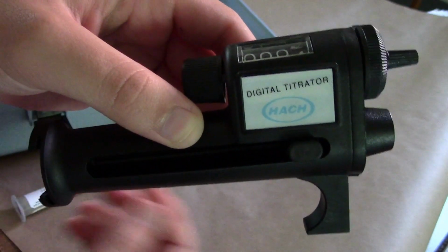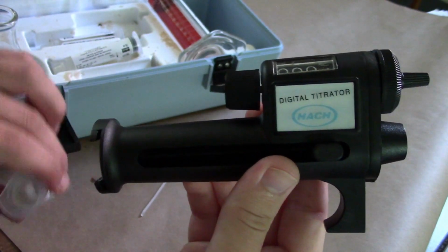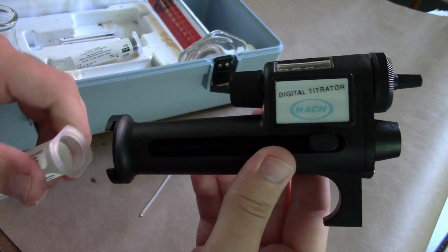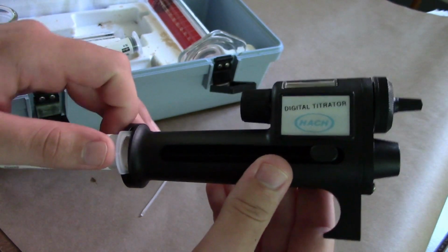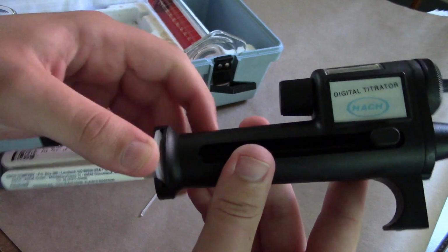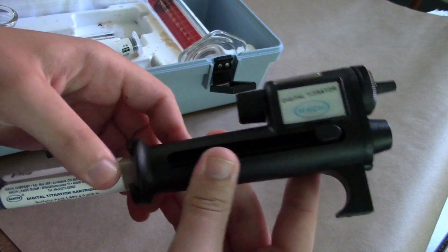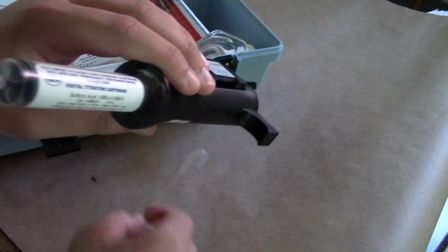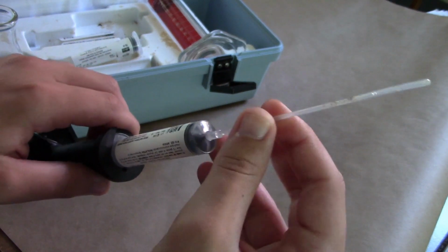So the first thing I'm going to do here is insert the cartridge of 1.6 normal sulfuric acid. Since I'm doing the 100 milliliter sample test, this is the one that I'm going to want to use. I'm just going to insert that in there, make sure that it is in all the way. And then I'm going to put this dispenser tube into the end of it.